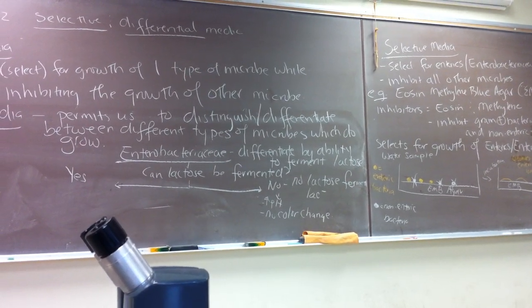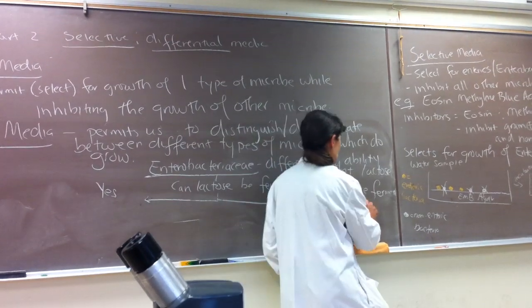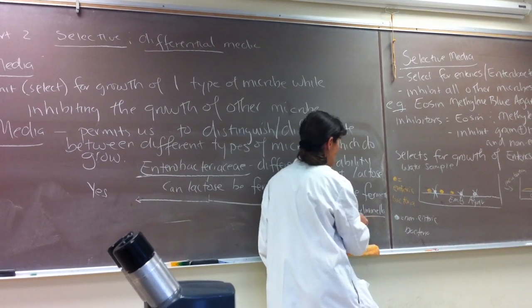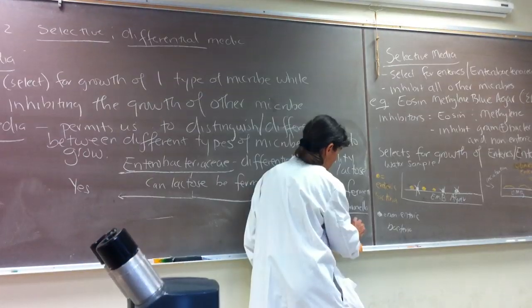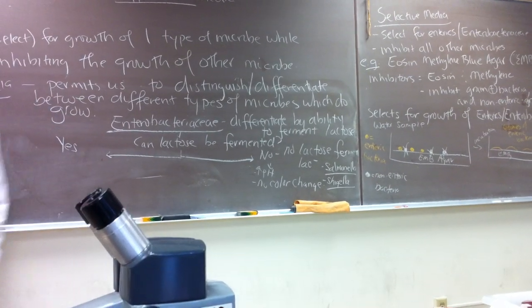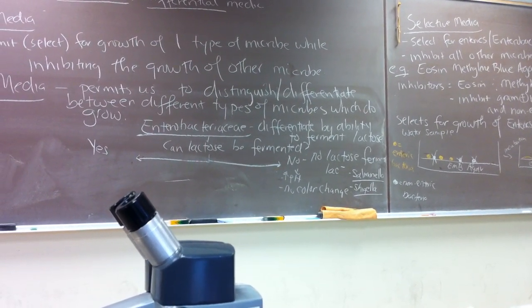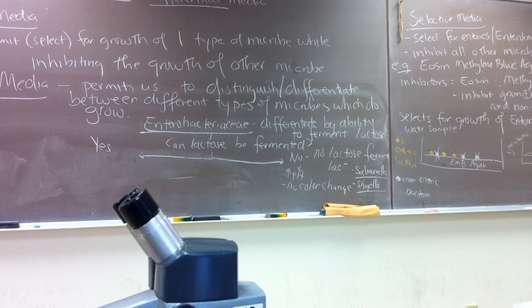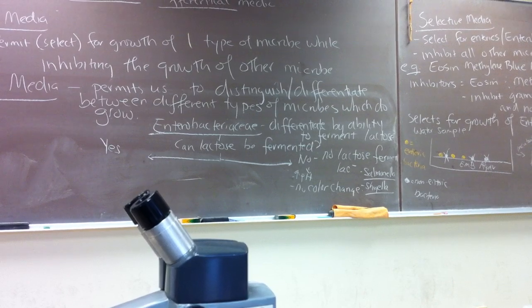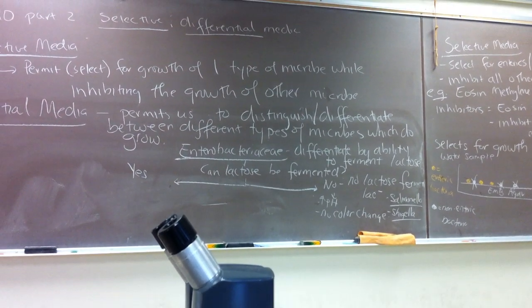However, there are some really cool lactose negative pathogens. For example, Salmonella is lac negative. And another important bacterial pathogen is Shigella dysenteriae, that causes bacterial dysentery. Those are both lactose negative enterics. So they can grow on Eosin methylene blue, but they won't have any color change in the media, and their colonies will appear basically the same color as the media. So that's not very exciting, right?